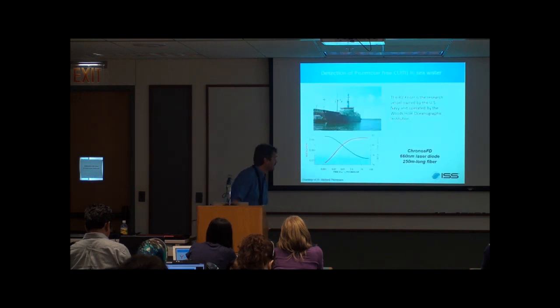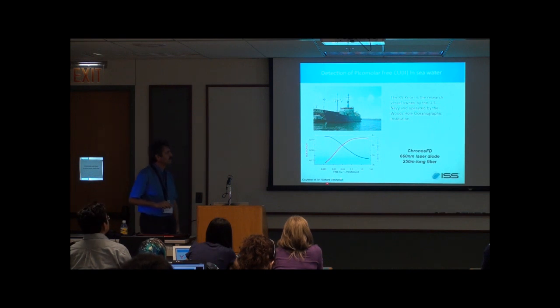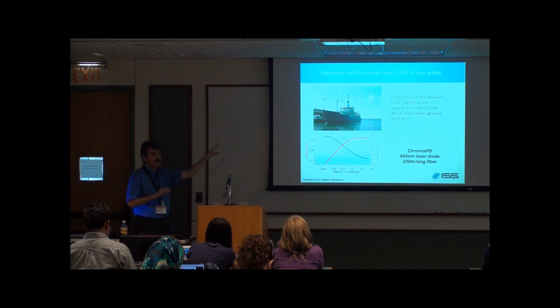This is an application made by Professor Thompson, who is at the University of Maryland in Baltimore. He devised some chemicals whose lifetime is dependent upon the concentration of copper ions in seawater. This is the difficult part, it's not the instrumentation.